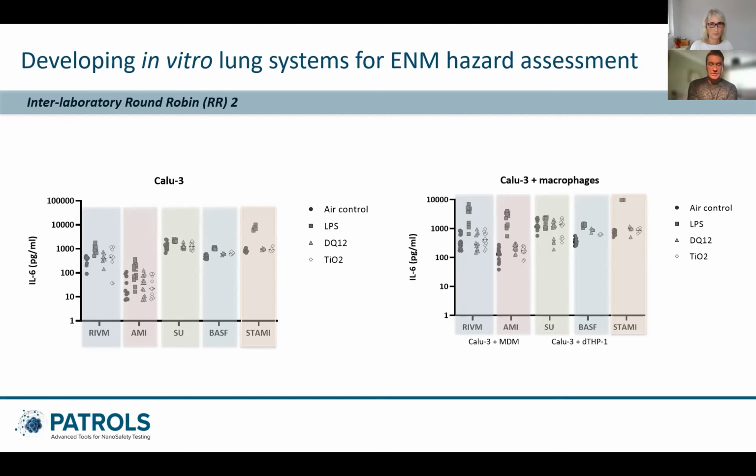we've assessed. And so this is a good finding, because we didn't want to find that everything was exactly the same, because that would be relatively boring. But it's good to see that the SOPs could be reproduced within the labs, and the differences that we see across labs are still being deduced at this moment in time.